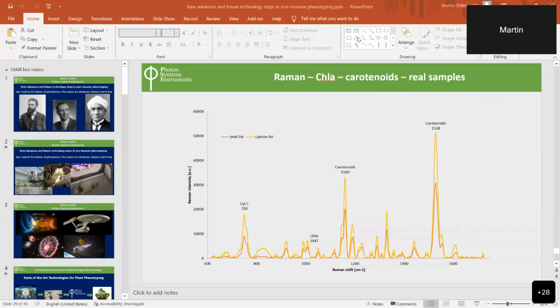Okay. So what is true is that Raman is mostly used for organic, not for non-organic compounds. But in principle, there are no limits. The problem is, if you measure the vibration of the molecules, you need a more complex structure. What at the moment is not really done, and this is what we do, is that with the specific sample, you need to develop a database where you can link the individual peaks. Because it's like mass spec, you are getting a number of peaks and nobody knows what these peaks mean, because some of these peaks are just parts of other molecules.